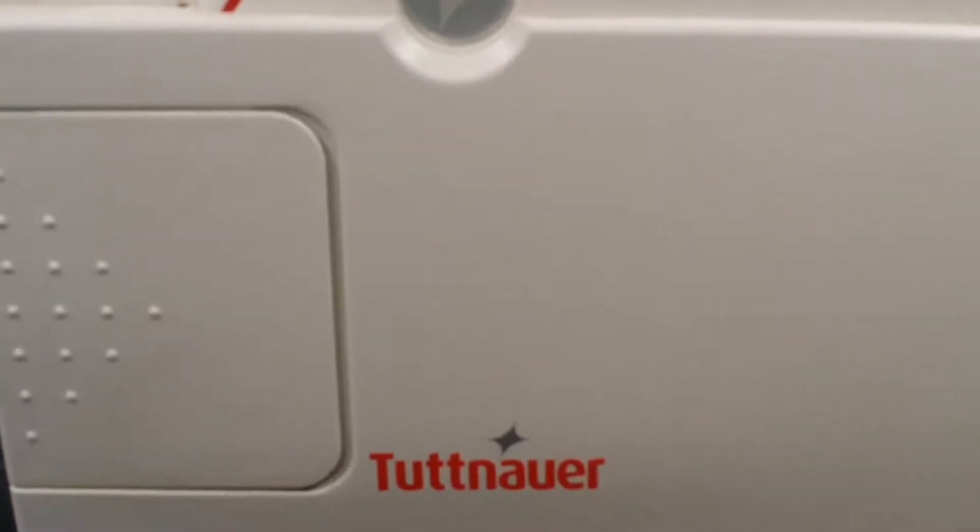Hi, good morning. My name is James from iSterilizer.com. Today in this video, I will show you how to repair the Tuttnauer Elara 11 autoclave.